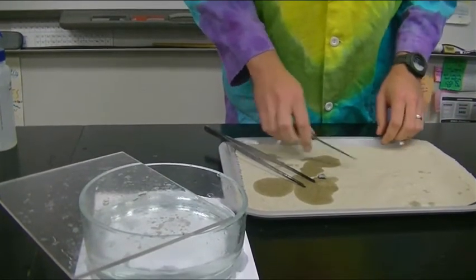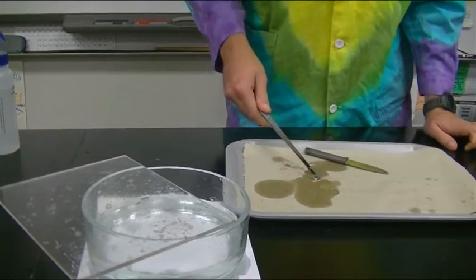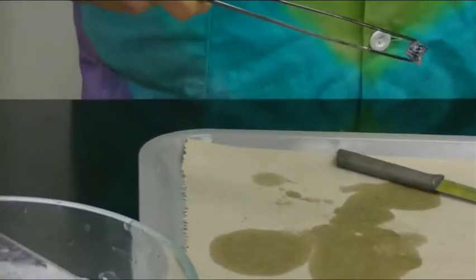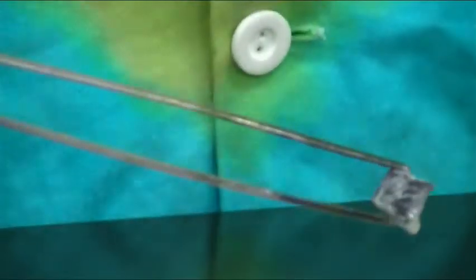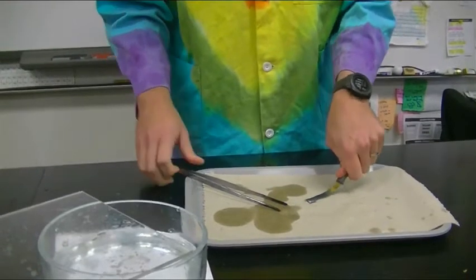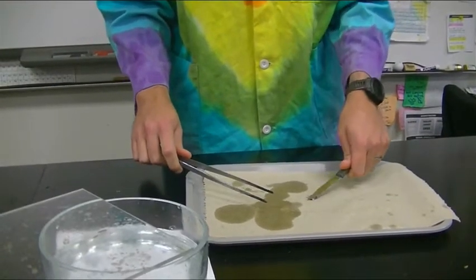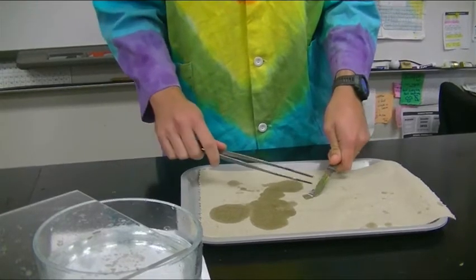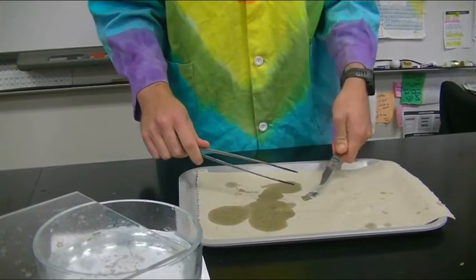Now, you'll notice that on one side of this, we got the oxidation layer. So it's pretty dark, if you want to zoom in on that. Pretty dark. But if I flip this over, look how shiny that is. Nice. All right. So I'm going to go ahead and just kind of smush this one. The alkali metals actually get a lot softer as you move down the table. It's another trend. It's kind of interesting. All right, just going to kind of smush it. Smush, smush, smush.